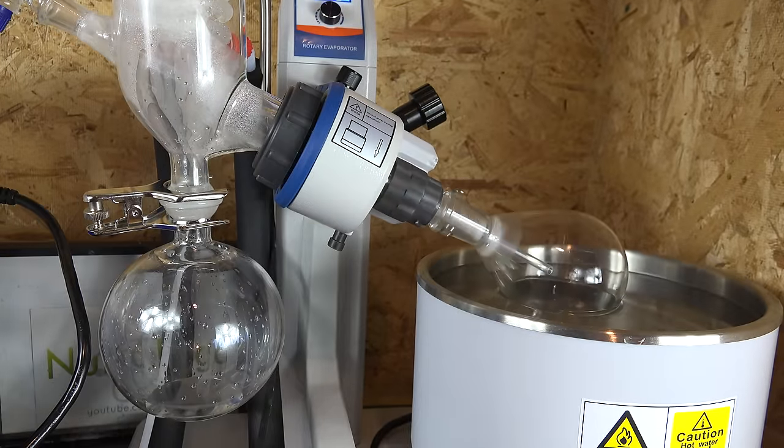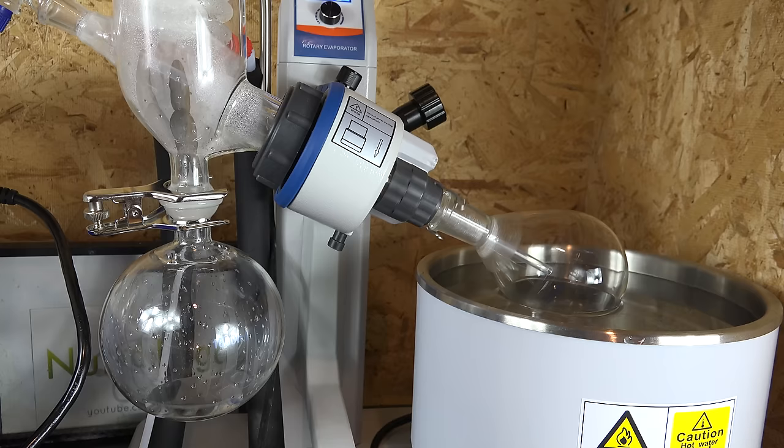There are gaskets and slip rings inside the machine that allow us to keep the condenser still while the flask rotates, but still maintain a nearly airtight seal.